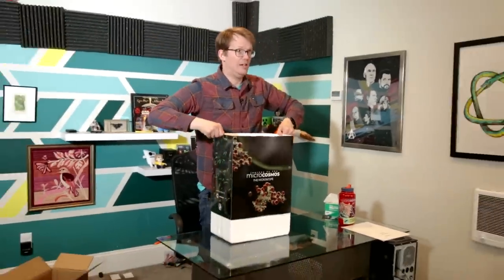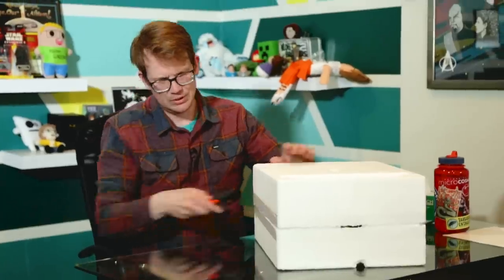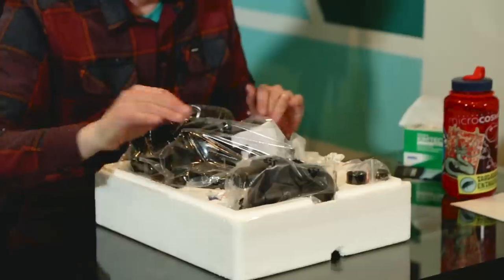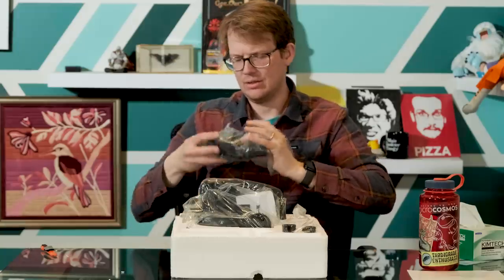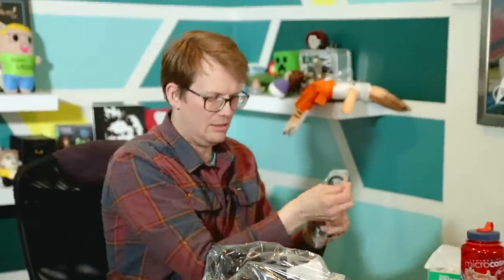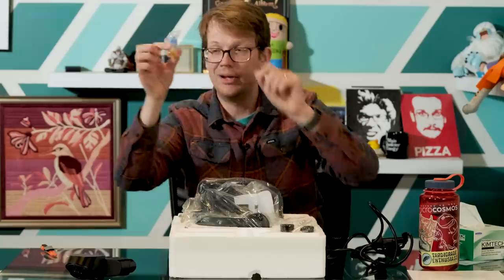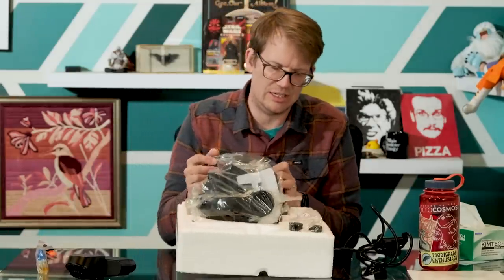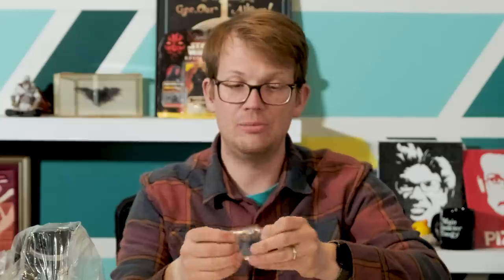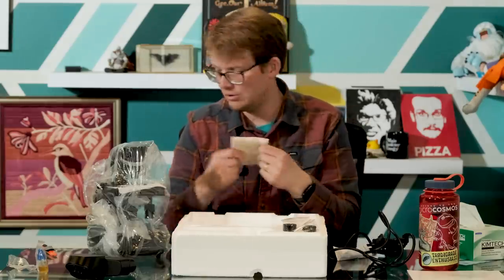We want to do clips of what y'all make. Inside the box you'll also find a power cord, our phone mount — which is a new version — a little bit of microscope oil for the thousand times objective, and then the microscope itself. There's also a blue light filter, and shoved in there will be your cover. You want to cover your microscope when you're not using it so dust doesn't get on the lenses.